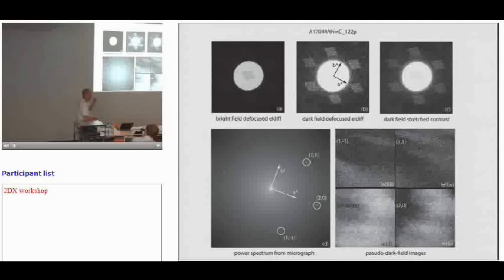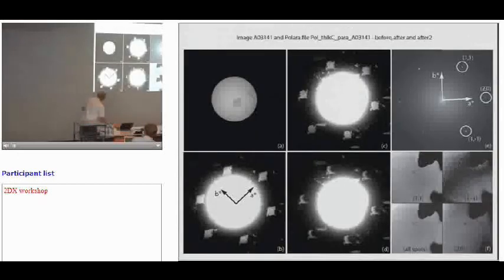But the one thing that for 2D crystals seems to absolutely solve it is you just use extremely thick carbon. So we made a carbon of about 350 angstroms thick, and it doesn't move. So here is not quite such a nice crystal. It's got the places where we were focusing sort of burnt out of it. But there is the bright field. There is the dark field. You can see that it's quite nicely oriented.